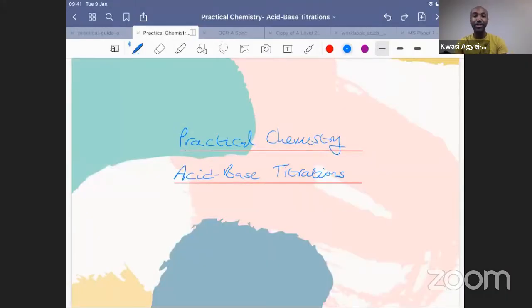Okay, so on your screens, you should see a title page, Practical Chemistry and Acid-Base Titrations. Of course, to start with, I would assume that you all know what a titration is, given that you will have first encountered it at GCSE. So in a titration, you've got a solution whose concentration is known very accurately, and that solution is then going to be used to find the concentration of a second solution.